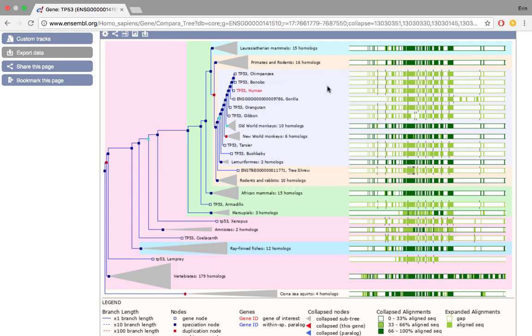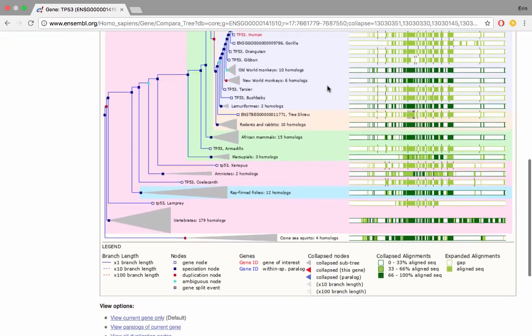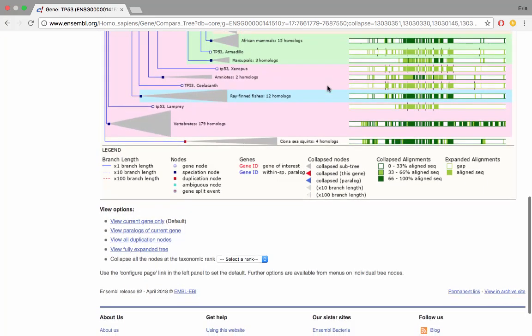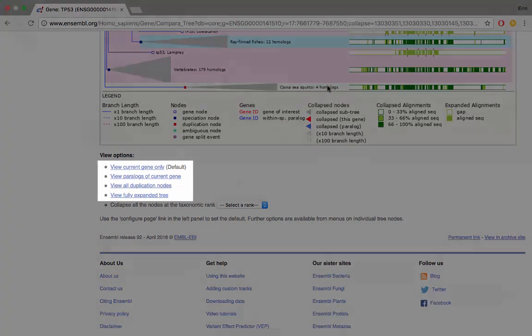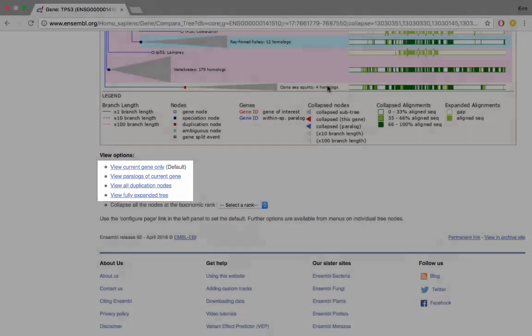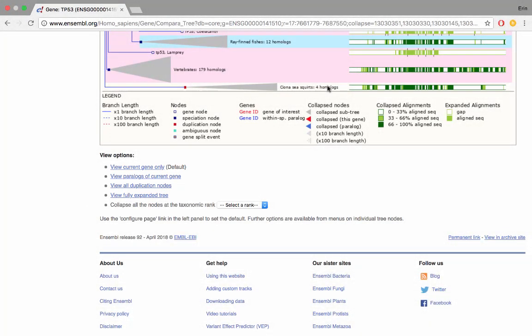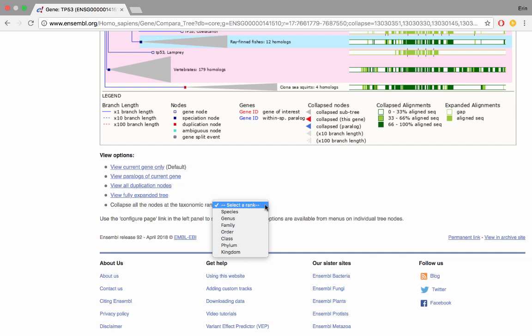If we scroll to the bottom of the page we'll see some options to quickly filter the image that we see above so we can opt to view current gene tree only, view paralogs of the current gene, view all duplication nodes or view a fully expanded tree. Also at the bottom we have the option to collapse the nodes of taxonomic rank so we could see only the species or at a higher level such as the order or the phylum and that would collapse the relevant nodes that we're interested in.